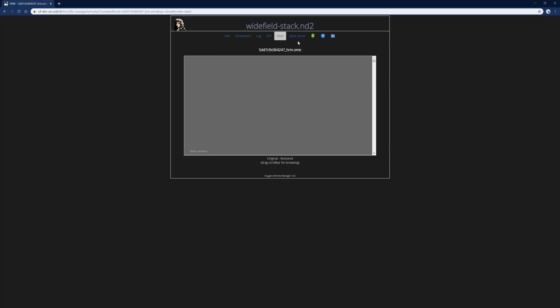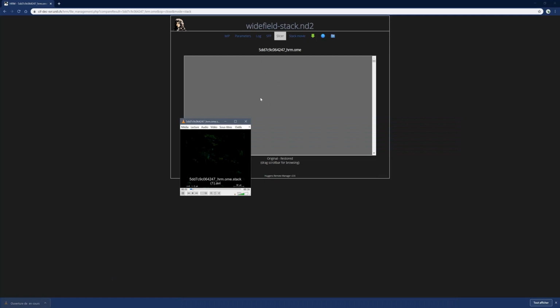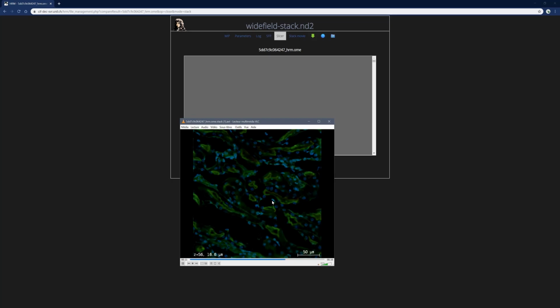You can view this also by clicking here on Stack Movie and download a small movie here. And if you open it, it will show you the same view here, but as a video file. So you can get here a small preview of the deconvolved dataset.